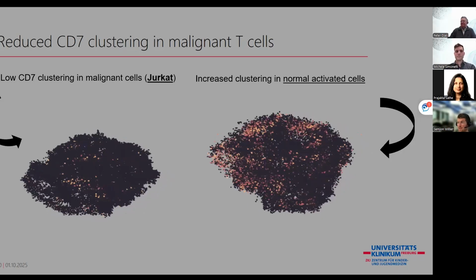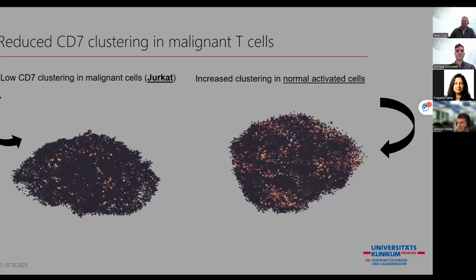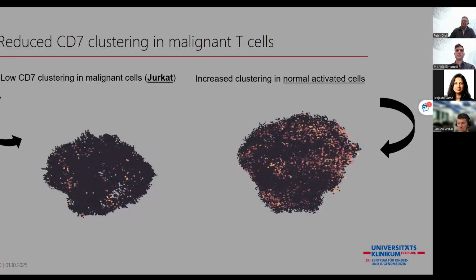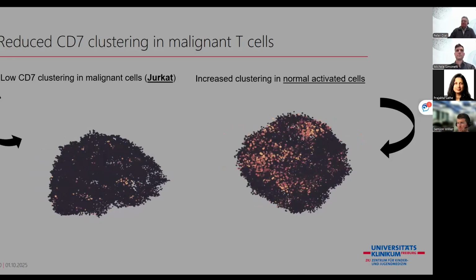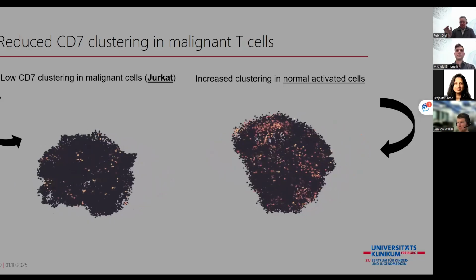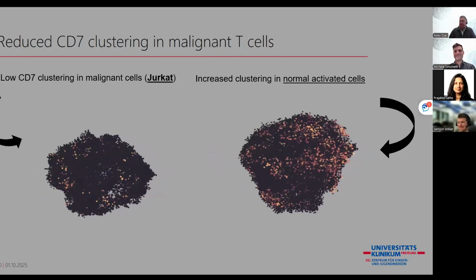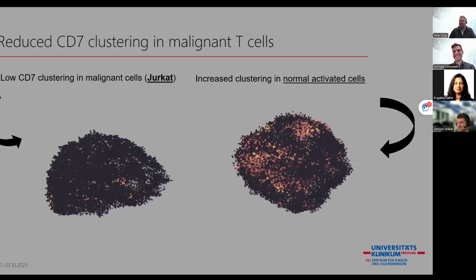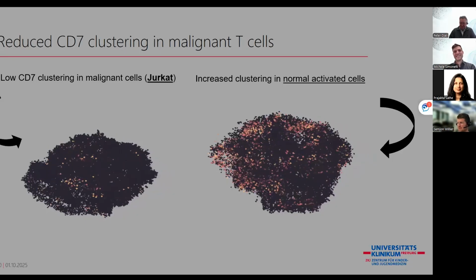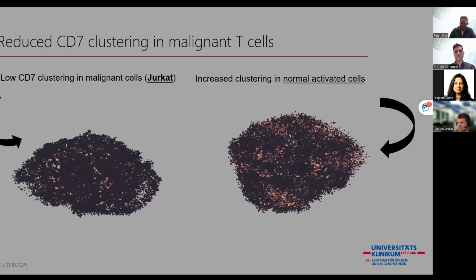But then I think it's really some features that you just cannot get your hands on with any other technology at the moment. And I can just confirm what Michele and Pete have alluded to: the necessities, you need the kit, this is for sure. But other than that, it's just basic lab resources and a sequencing provider. And then you can generate this kind of data.